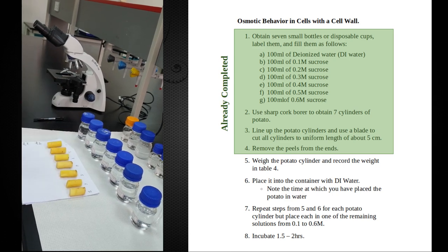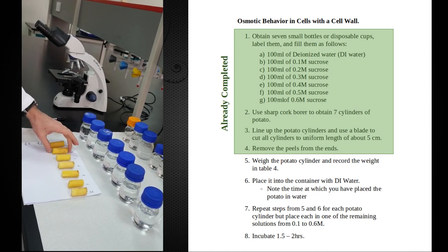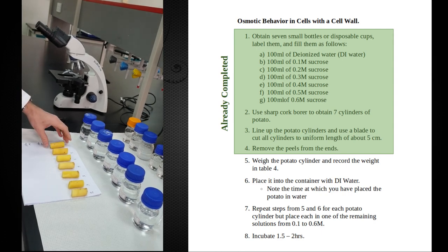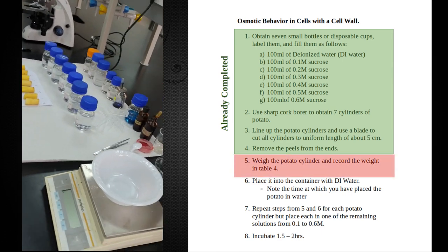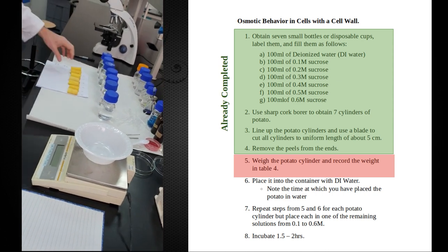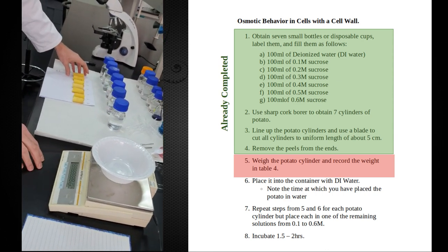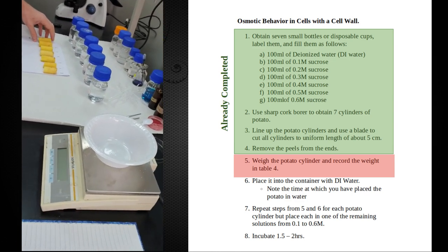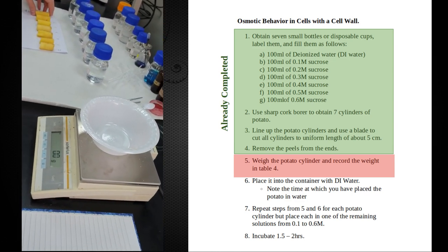So what we have here are a bunch of these potato cores that we're going to first weigh. So I am going to turn on the balance. So I'll give it a moment.